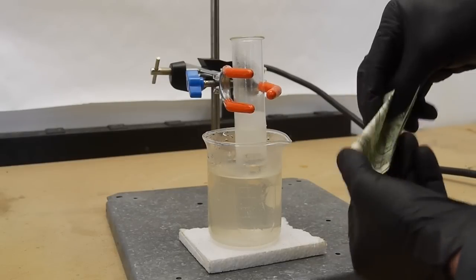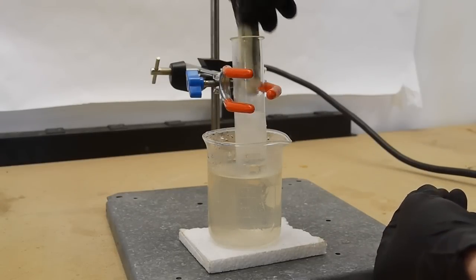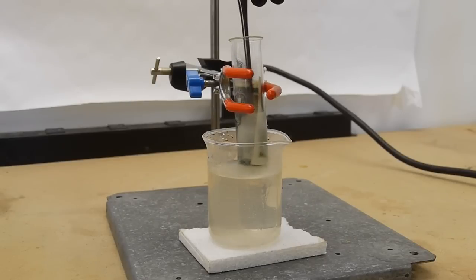I shrank this dollar by repeatedly dipping it into anhydrous liquid ammonia, taking it out and drying it, then dipping it back into the ammonia again. This is a different process than just putting it into a chamber filled with ammonia gas — in this case we're actually soaking it with liquid ammonia.